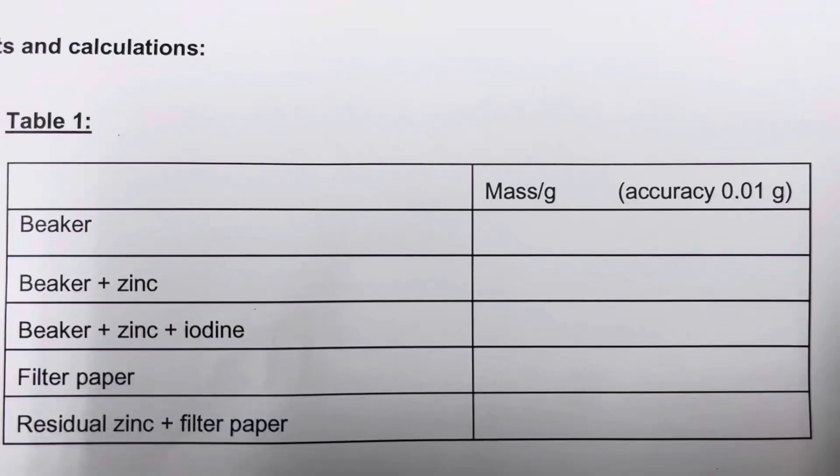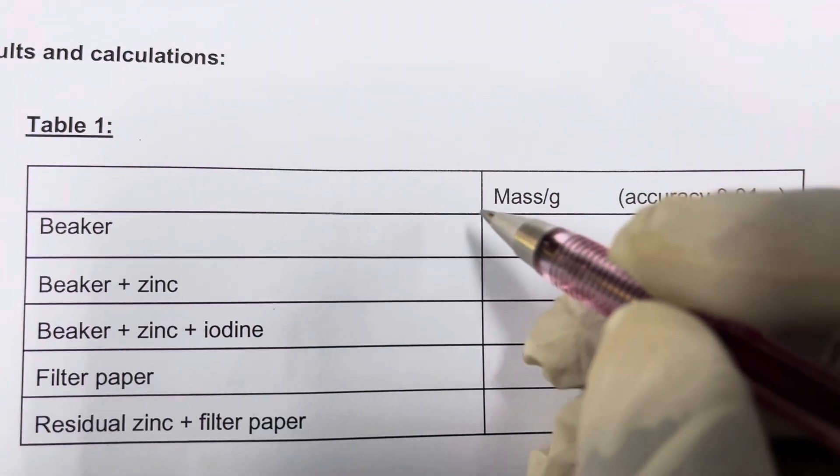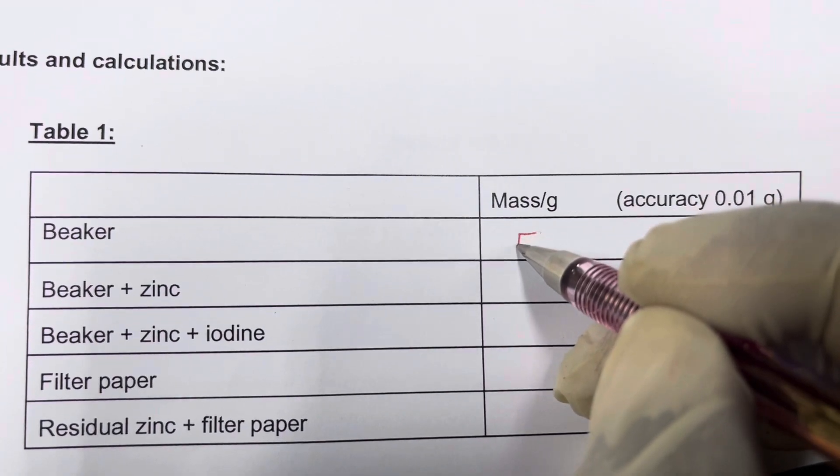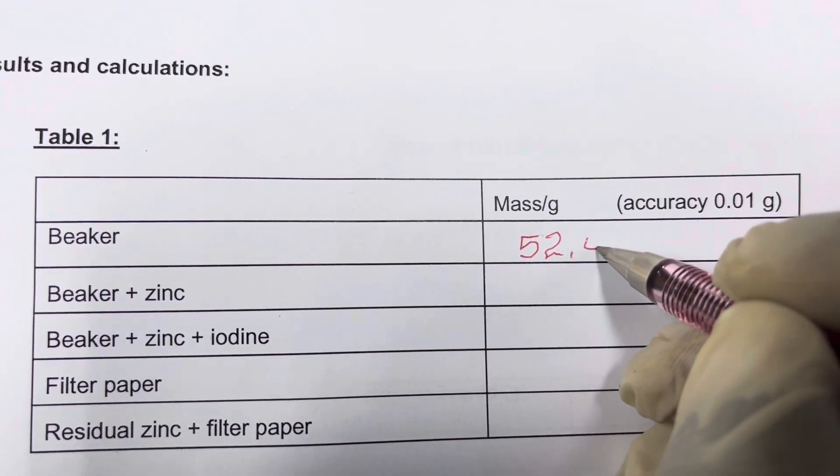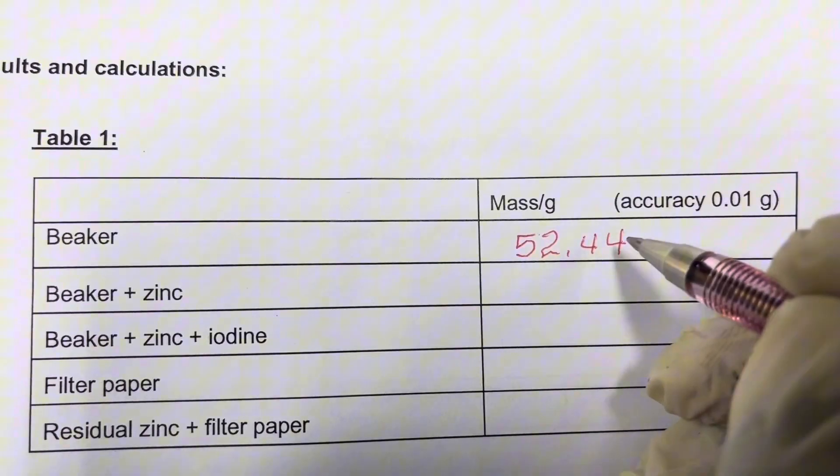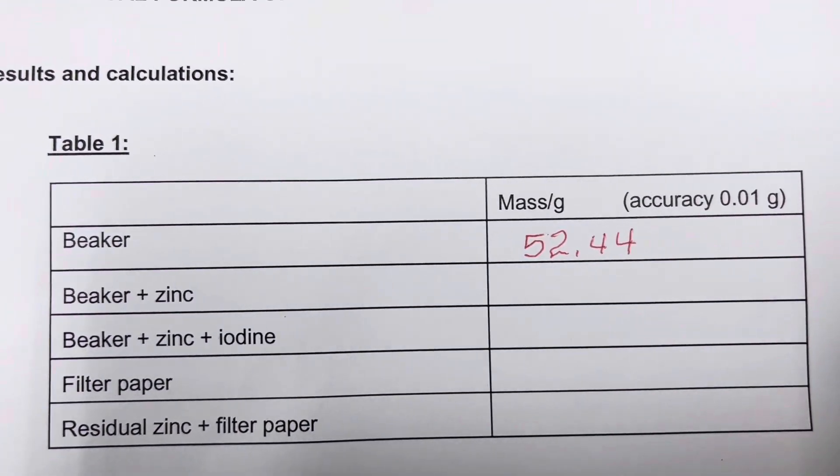Let me record on the table. This is my table. I'm going to record that value, which is 52.44 grams. That's the mass of the beaker alone.